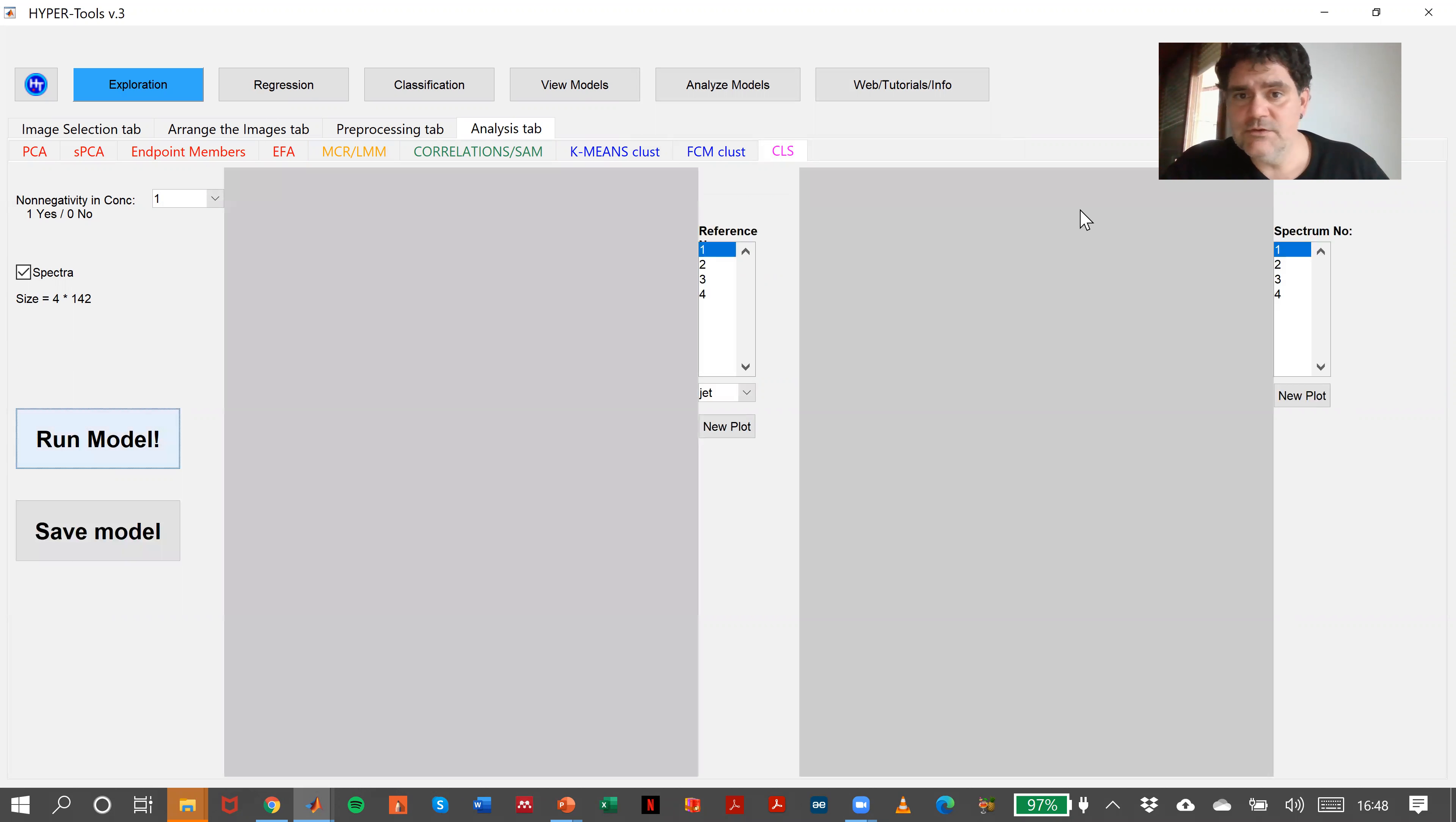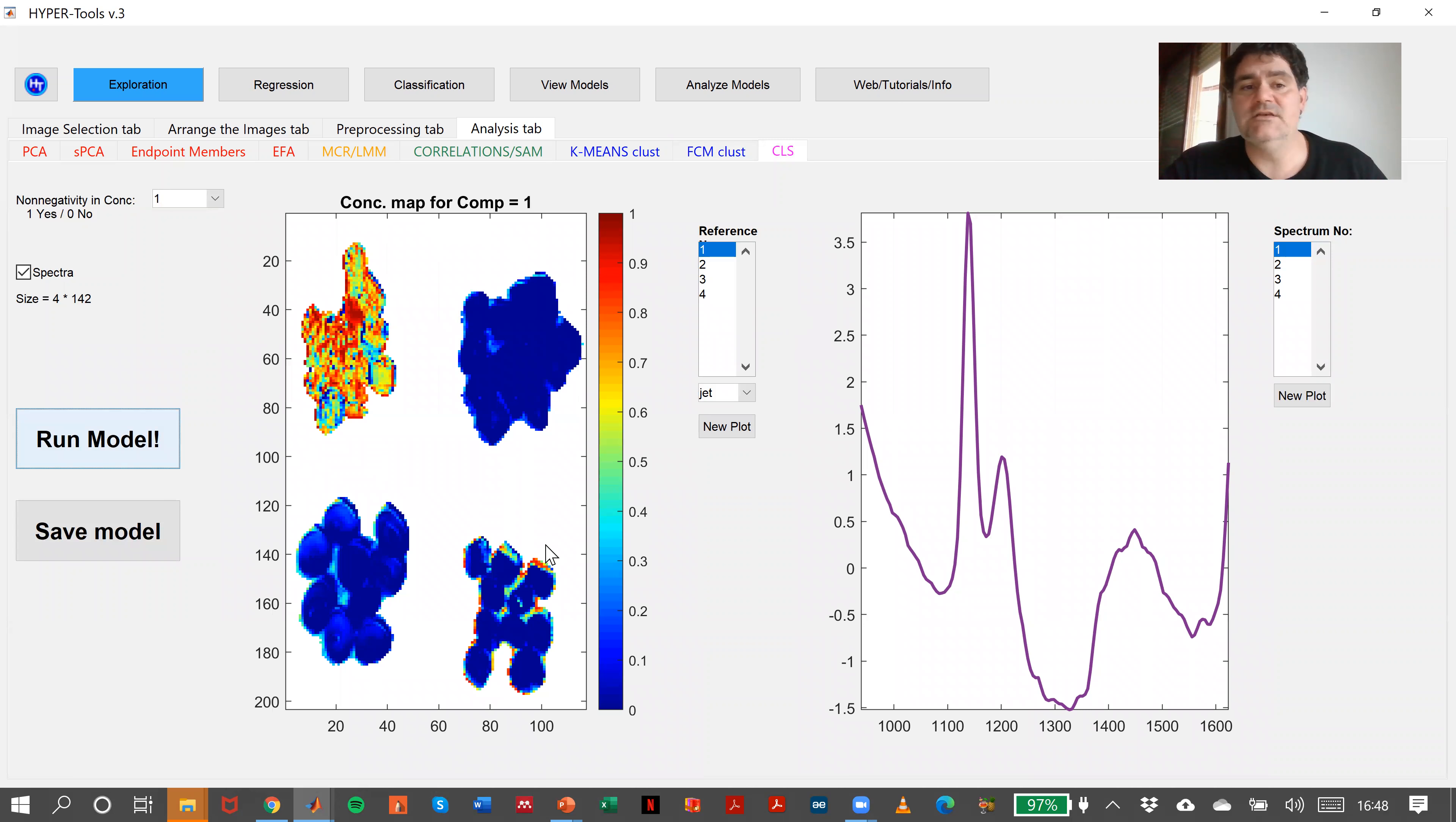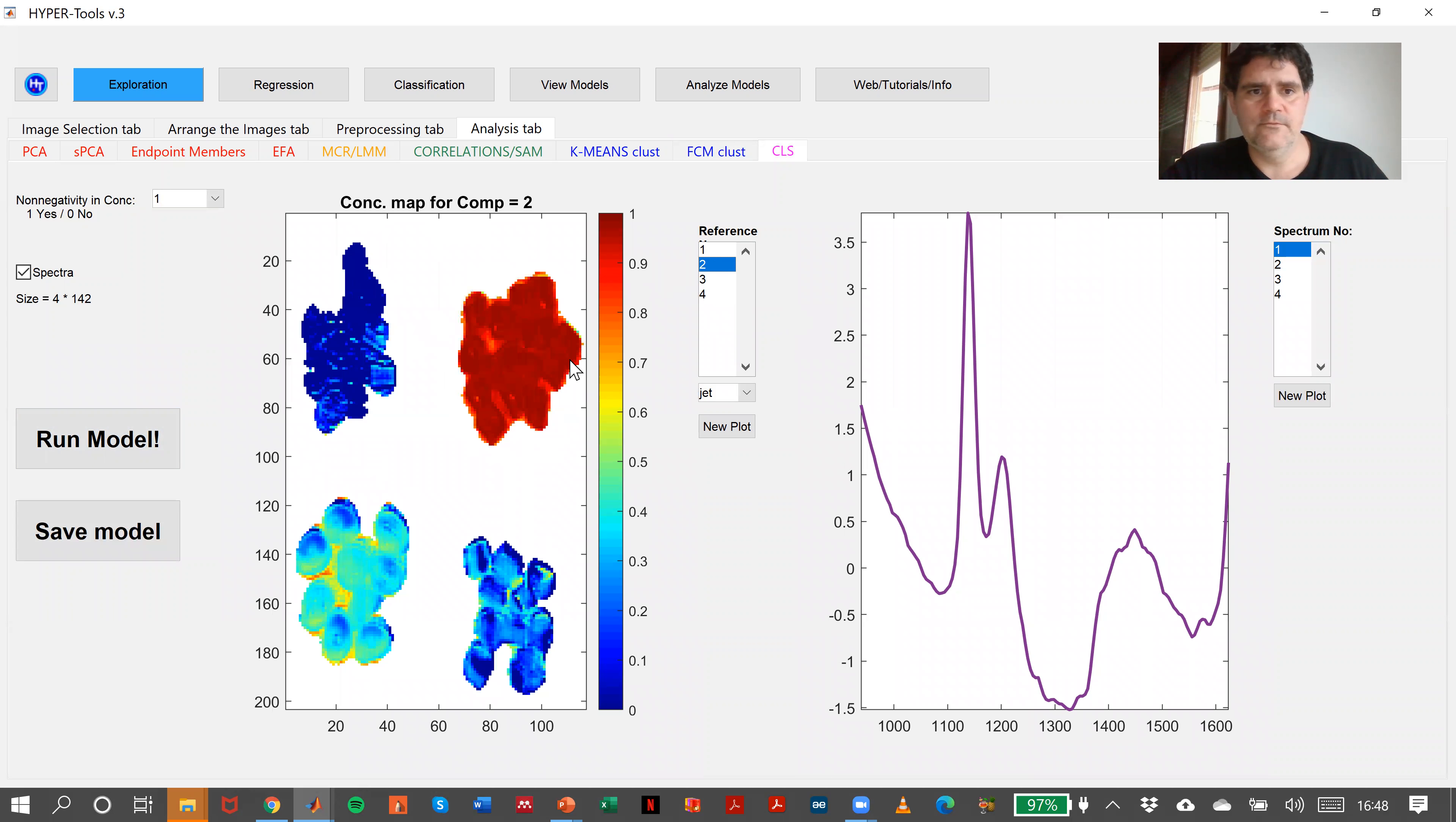The display will be the spectra that we loaded, because this is just classical least squares, and the concentration map found for each one of the plastics. In this case, plastic one, plastic two will be here, I assume.